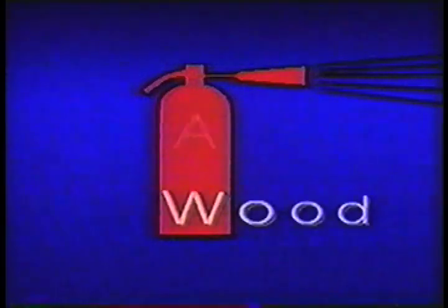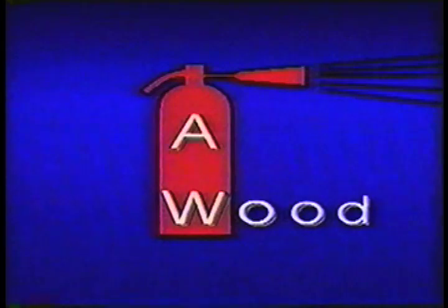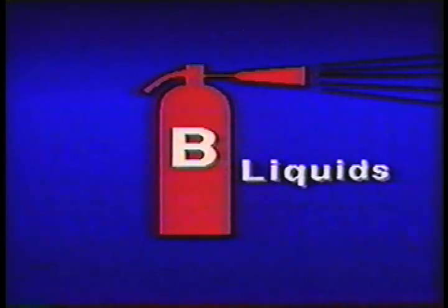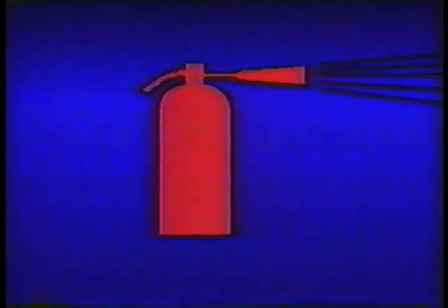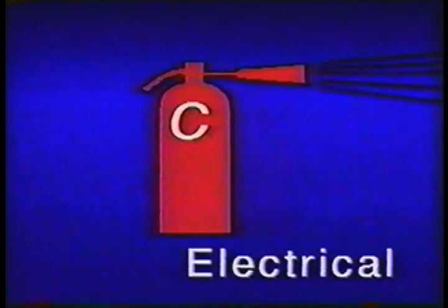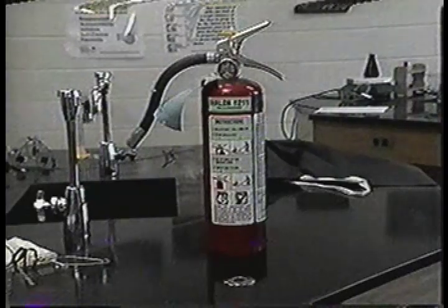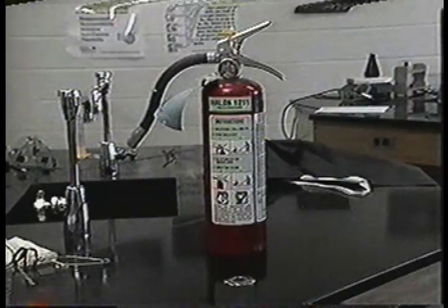Not all fires can be extinguished by the same fire extinguisher. The letters A, B, or C indicate the types of fires these particular extinguishers can put out. Wood fires require an A designation. A. Wood. Liquids need a B rated unit. B. Liquids. And electrical fires should be extinguished with a C rated extinguisher. C. Electrical. Most labs use multi-purpose extinguishers that can be used on fires regardless of their fuel source.